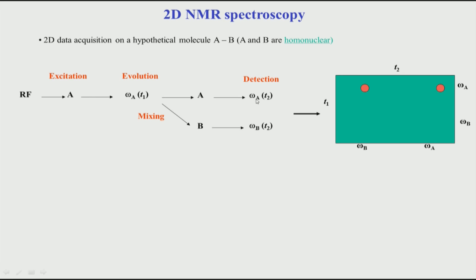So, consider T2 as one dimension and T1 as another dimension. In both dimensions we now have A and A. So, that will correspond to this. Here, basically, the frequency is A and this. Let me correct this because of a slight shift here.